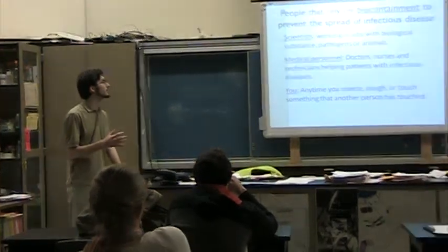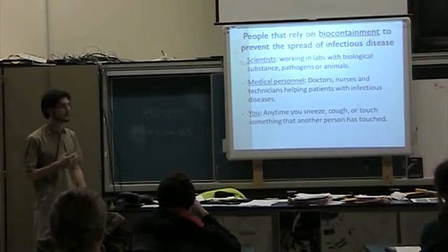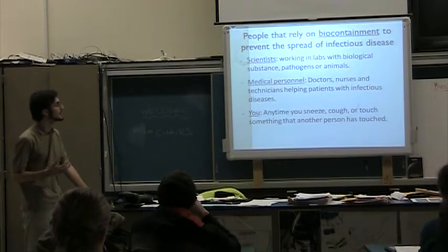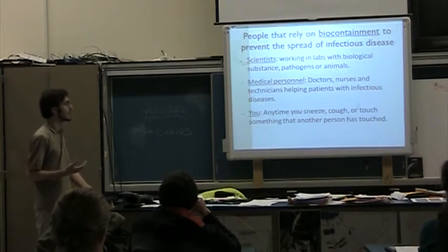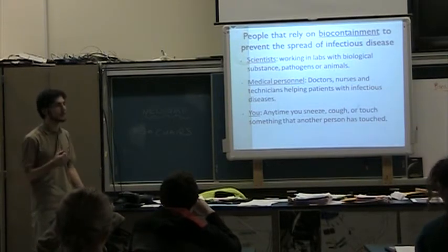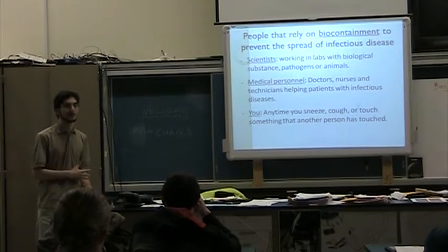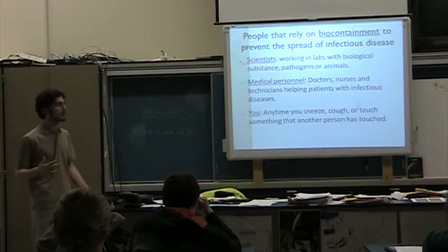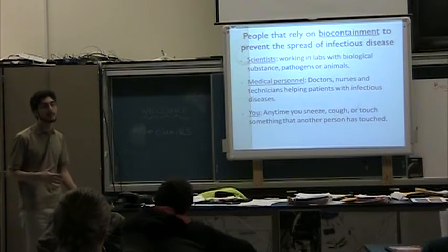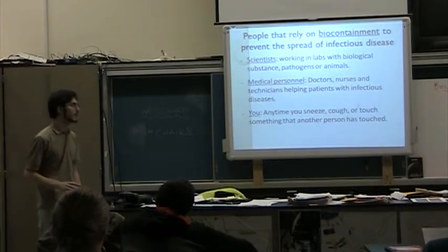The kinds of people that rely on biocontainment are scientists, medical professionals, and everyone else to a lesser extent. Scientists, because they work in labs using biological substances like pathogens. Medical personnel, because they work with biological substances like blood and other bodily fluids, and they have to make sure that they don't contaminate anything, and if they do, that they follow the proper procedure to sterilize it.